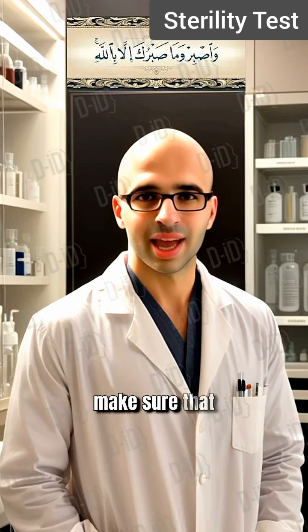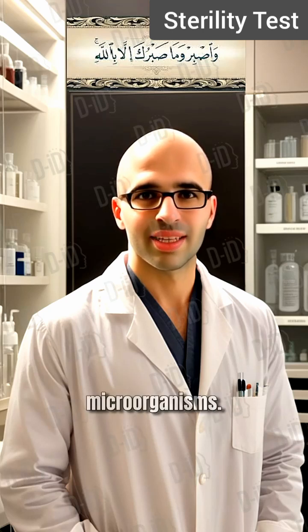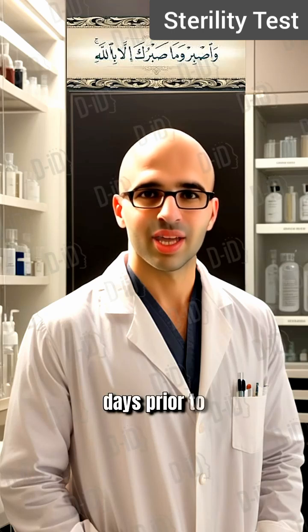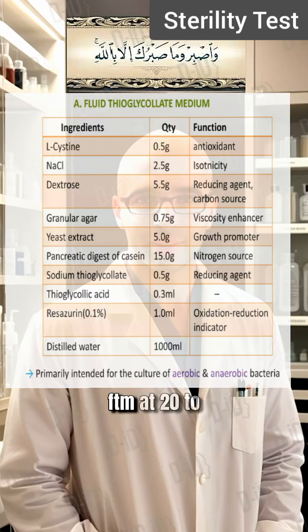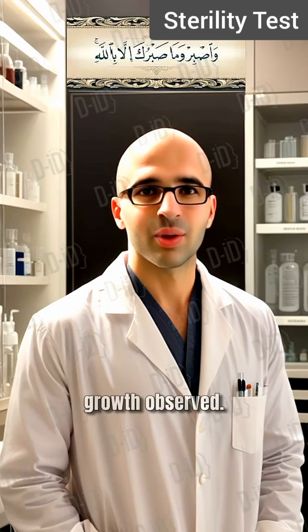Prior to test, make sure that: 1. Media is sterile, by the media sterility test. 2. Media supports growth of microorganisms, by the growth promotion test. Media sterility: a negative control may be used to identify a false positive test result. Incubate for 14 days prior to use, or this may be conducted concurrently with the test, at 30 to 35 degrees Celsius for fluid thioglycolate medium, FTM, and at 20 to 25 degrees Celsius for soybean casein digest medium, SCD/TSB. Acceptance criteria: the media should be sterile, with no growth observed.